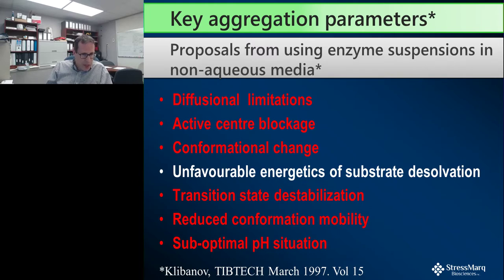If the sonication process doesn't just chop fibrils up or make them shorter, if in fact it has an impact on solubility or solvation of the fibrils, then could the much more successful and higher rates of reaction that we see after we have conducted our sonication process be due not just to shorter fibrils, but to the fact that we may be placing the entire experimental setup into one phase rather than two phases? So rather than having a solvated substrate and a desolvated product, maybe we're putting everything into solution.